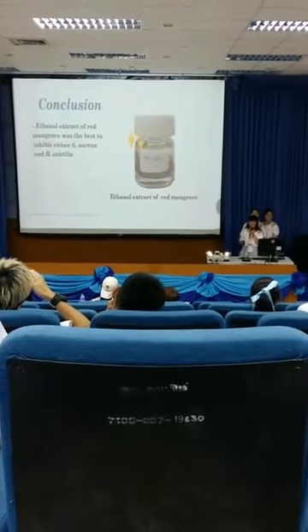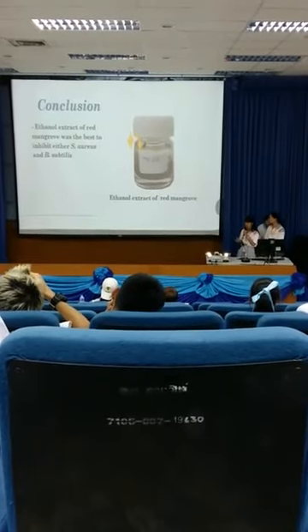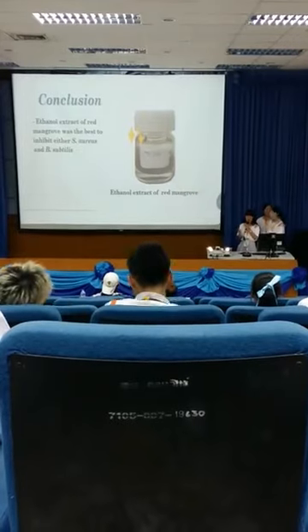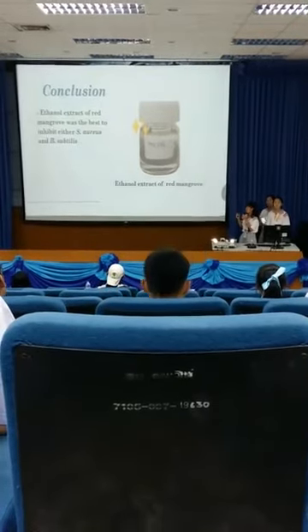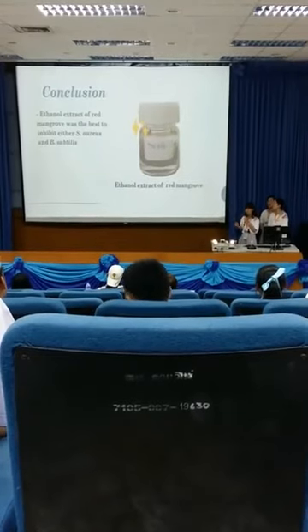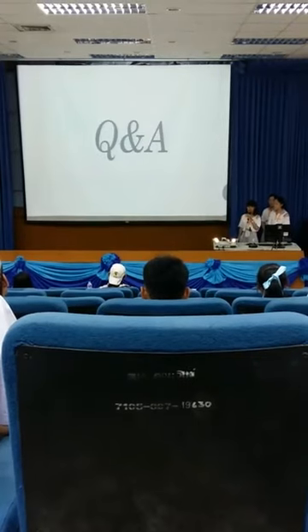For conclusion, from the results of the agar dilution method, MIC and MBC, and the amount of antioxidant, the ethanol extract of red mangrove was the best to inhibit Staphylococcus aureus and Bacillus subtilis. Thank you for your attention.